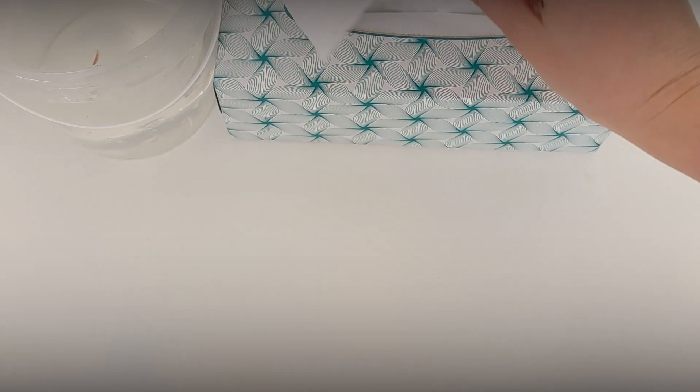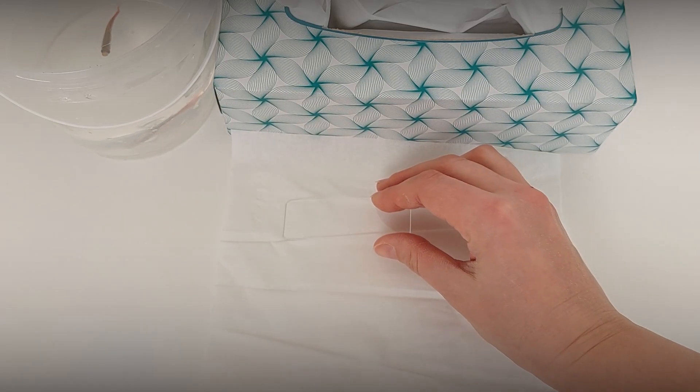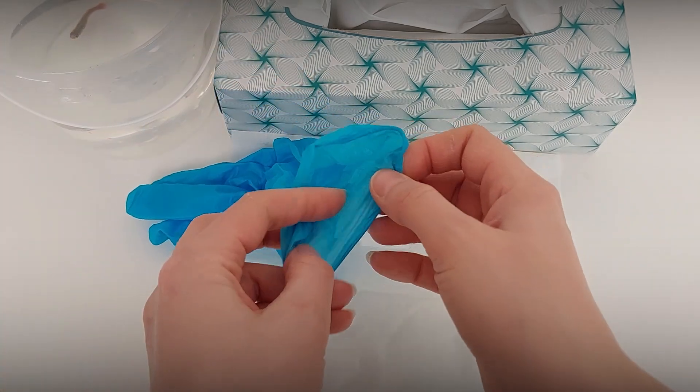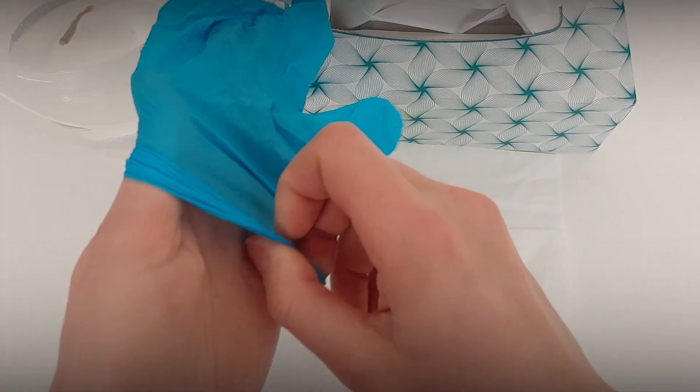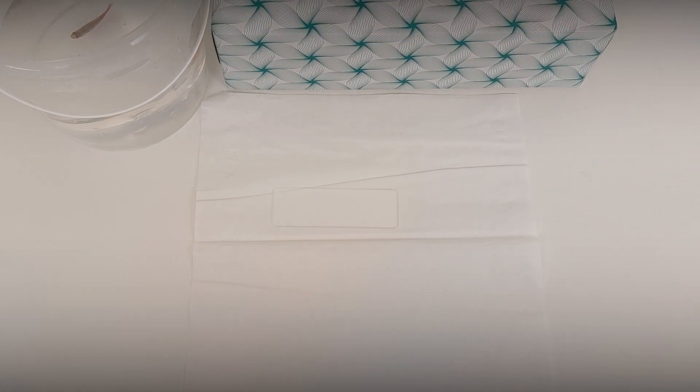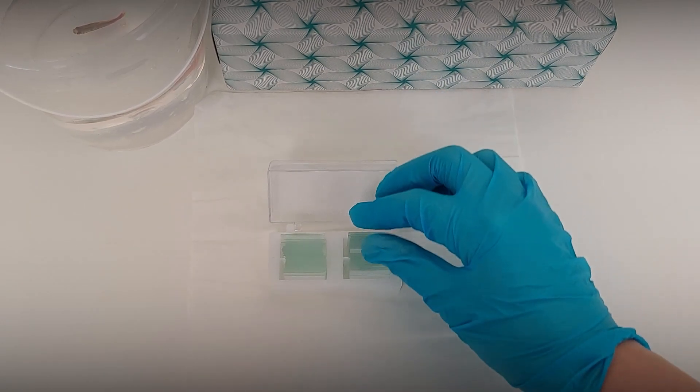Place the slide on a tissue or towel to prevent water from getting between the glass and table. There are several different ways and various tools we can use to do the skin scraping. For this small sized fish, I prefer to use a cover glass. But for larger fish, I use a slide.